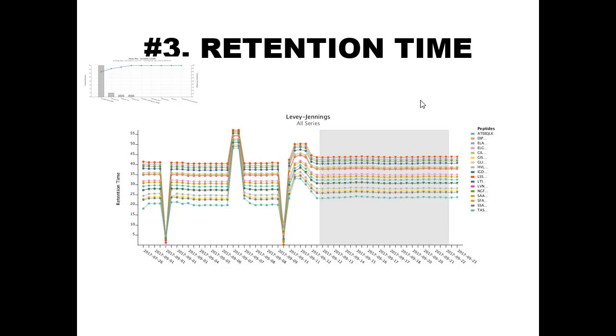You can set it to monitor a folder that was collected in the past by adjusting one of the parameters in AutoQC to have it watch the folder for older files, right, Pagisha? Yeah. Typically, I think we have our parameters set for files no older than like 3 days or something. Does that sound right? But on that first instance that you start up AutoQC, if the files are still sitting on your computer, you can just say, from like 10 years ago, pull in all files that match this particular setting.